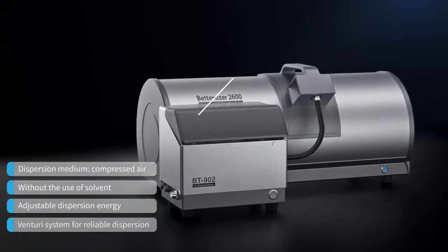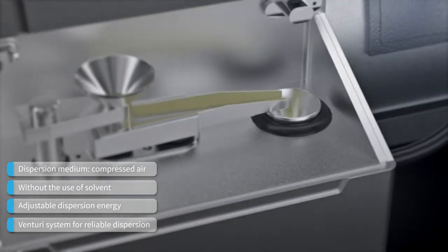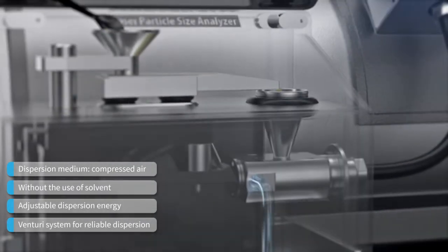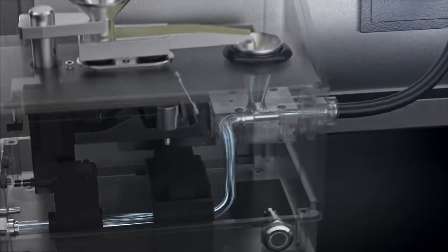The selection of appropriate dispersion energy breaks up agglomerates, and the patented optical system of the BetterSizer 2600 provides accurate sizing results of dispersed particles.